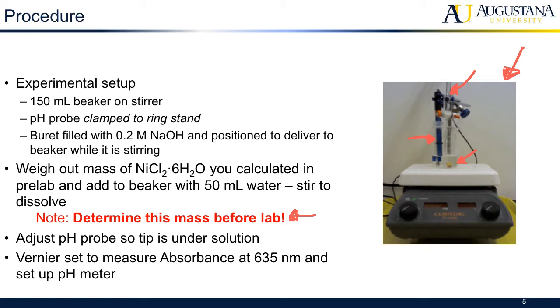At that point, you will measure the pH, and you will remove, using a pressure pipette, a transfer pipette, some small sample from the beaker and put it into a small test tube, which we will centrifuge.